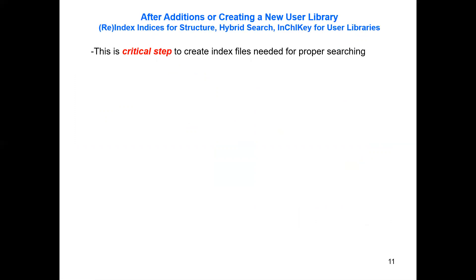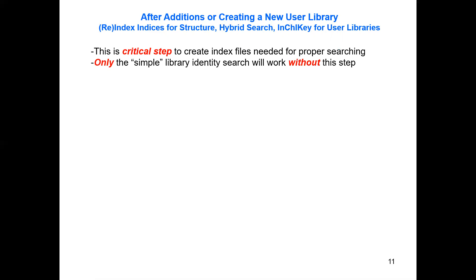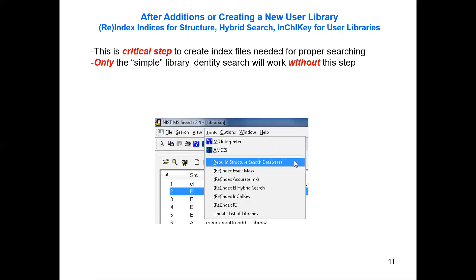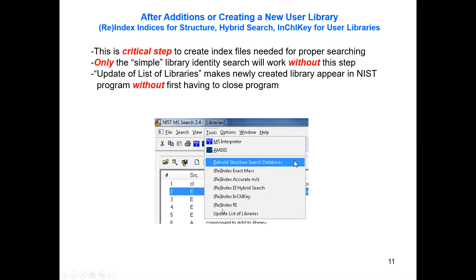I need to remind you: after you create a user library, a critical step is that you have to create index files to have these libraries properly searched. Only the simple library identity search will work without this step. Remember, go to the Tools option, pull it down and say 'Rebuild' — the structure index, the hybrid, the InChIKey, and if you added retention indices, those as well. Also, when you create a new library you need to say 'Update List of Libraries' so the program will know your library exists. If not, you'll have to exit the program, and every time it starts back up it looks for additional libraries that may have been added.